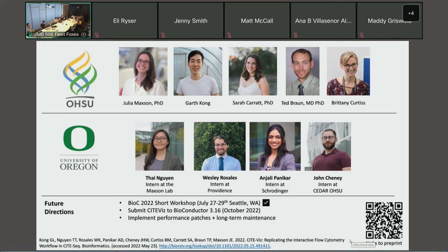the ability, like you said, to look at how well or poorly. We know that correlation between ADTs and mRNAs is often awful. We've plotted this for an awful lot of ADTs. So we know that it's really not even second best. It's just one step up from the worst to use mRNA instead of an ADT. But sometimes we don't have any option if we want to set up a gate. How soon in the near future do you think there'll be functions to retrieve a gating scheme that the user has set up so that it can be compared against something that was computationally prepared?